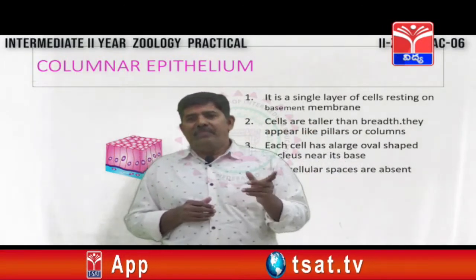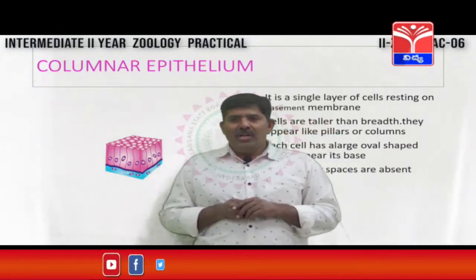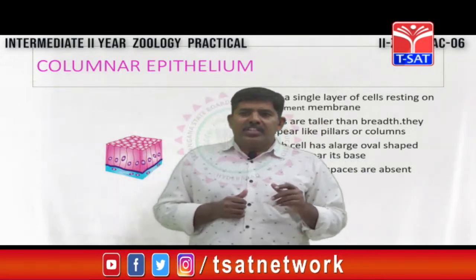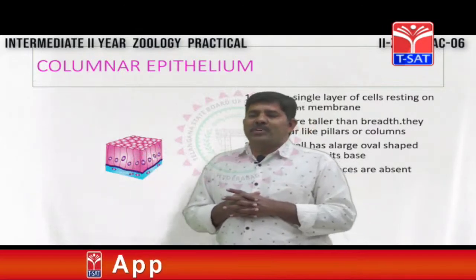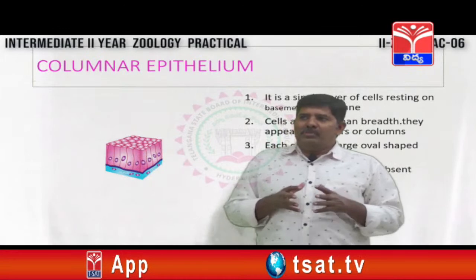This is a very important difference between simple epithelium and columnar epithelium. Intercellular spaces are absent in this area. Intercellular space is absent. This is about the columnar epithelium.